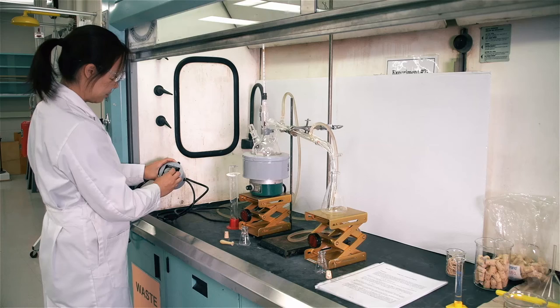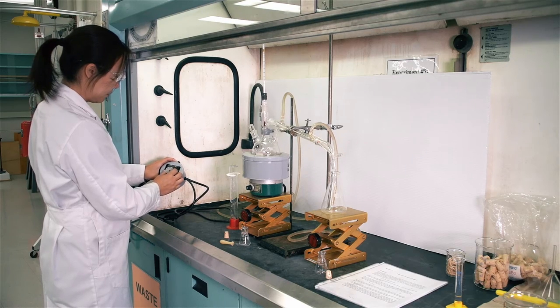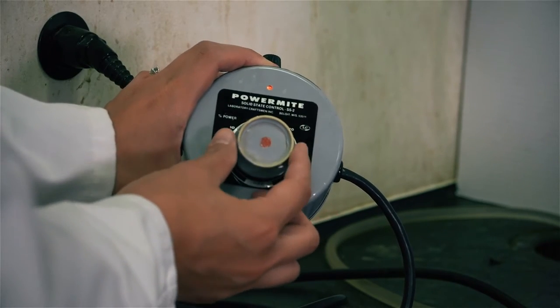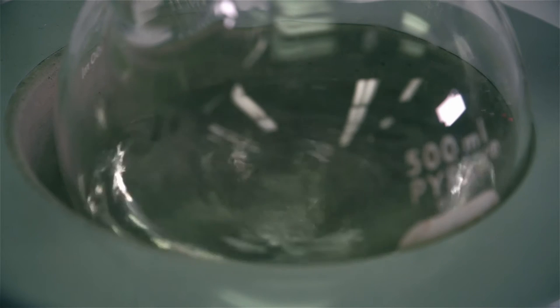Slowly turn on the magnetic stirrer. Start the distillation by setting the rheostat initially at 70. This value can be adjusted as required. Boil and distill gently.